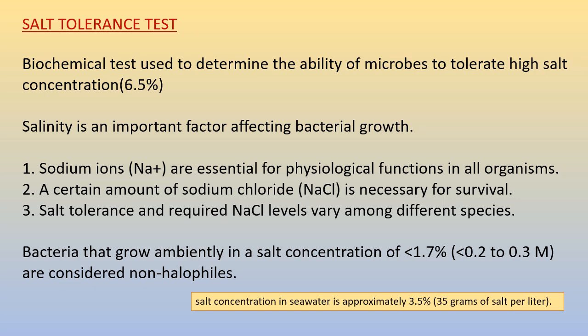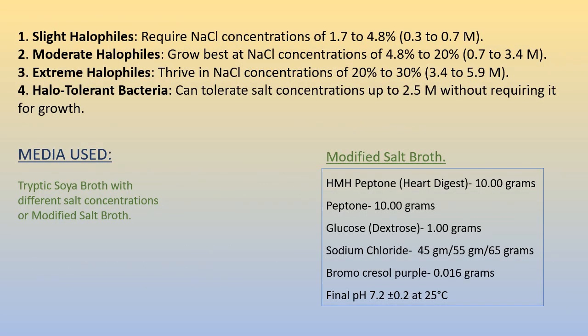So remember that. Now the salt concentration of seawater is approximately 3.5%, that is 35 grams of salt per liter. So you can see how salty our seawater is. Keeping this in mind, you can plan your salt tolerance test, that is, how much concentration you need to test.